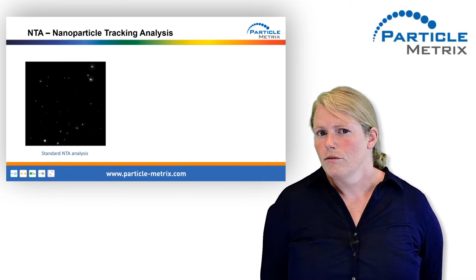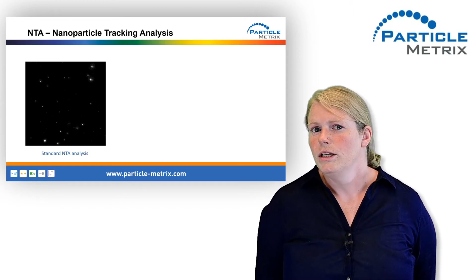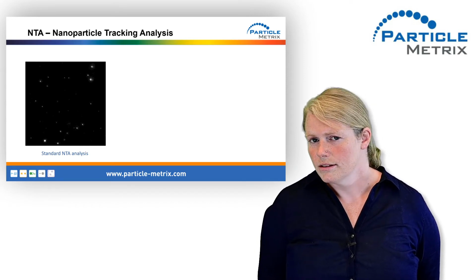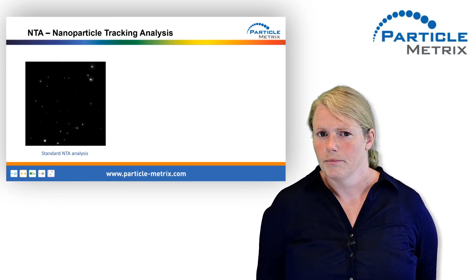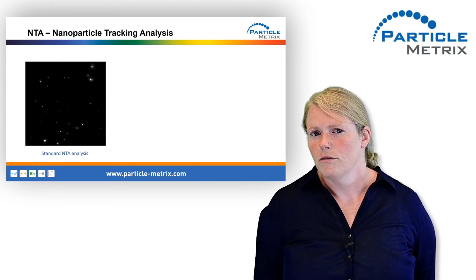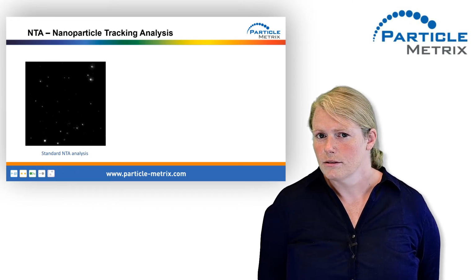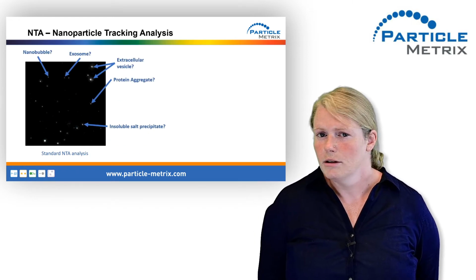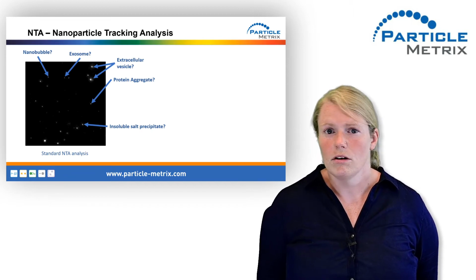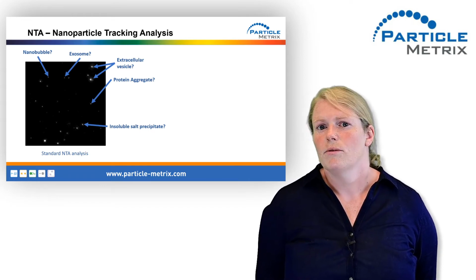Now, I gave you a brief overview about NTA, but the title of my talk says fluorescent NTA. Why do we need fluorescence at all when we can analyze all these parameters in scatter mode without fluorescence? The answer is easy. In an NTA device, our particles look like this. They are bright stars in front of a black sky. But how can we be sure that we are really looking at our exosomes? Couldn't this particle be a nanobubble or a protein aggregate, an insoluble salt precipitate? All of them have roughly the same size and the same scattering abilities, meaning that they look the same in our NTA.